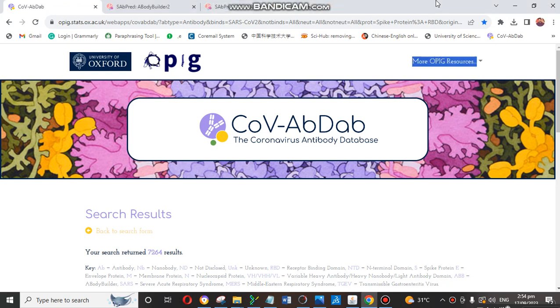In this video, I'm going to show you how we can make the antibody Fv region model and how we can predict our model from the light chain and heavy chain.